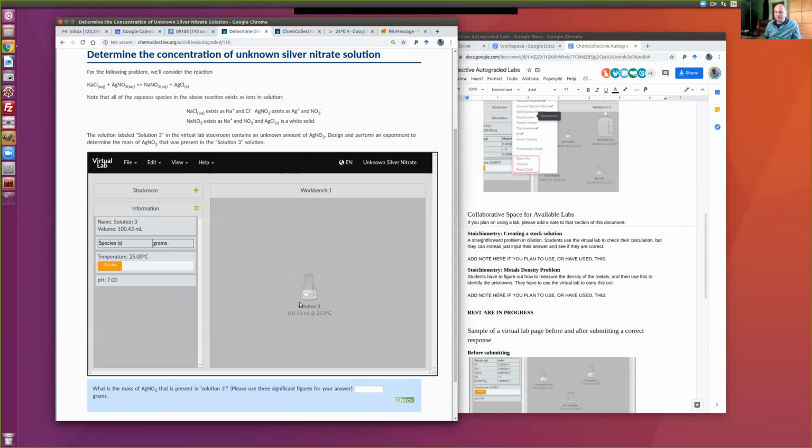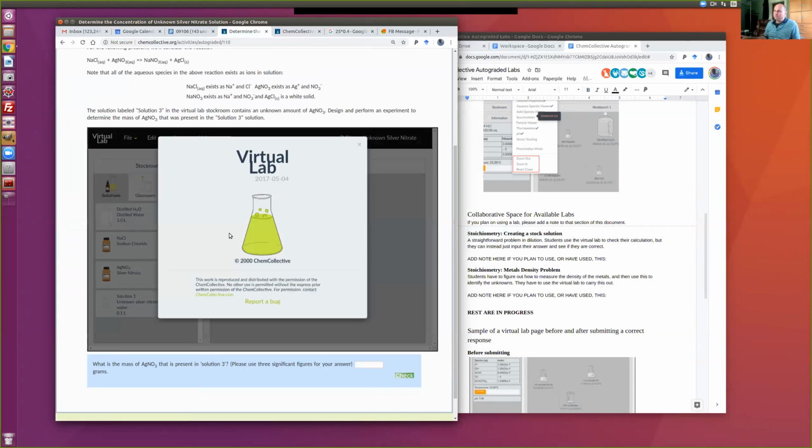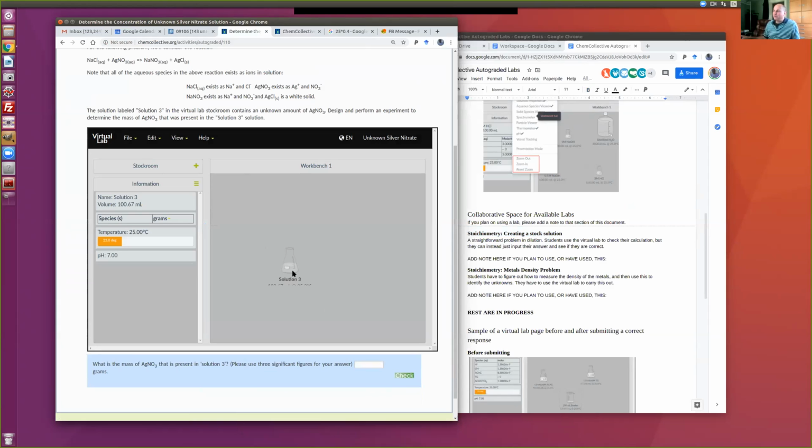So when we say randomized, we mean that for this instance, there's a specific number of grams in this. So if a student just sort of randomly guesses, after the third try, it will say, "Oh, you got it wrong 3 times in a row. You now need to reload the page." And it's the same problem, but the solution is different. So that's to prevent them from just randomly guessing to try and get the answer. So I'll bring on a solution.